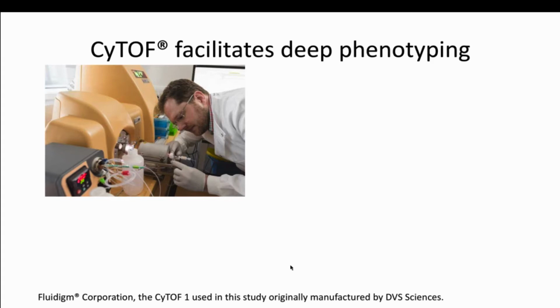Thanks. So it was immediately apparent when you first came to us in the core facility with this project that this was a great fit for CyTOF. This is a project which involves deep phenotyping, so very fine immune phenotyping, and it was working on liquid biopsies. So working with peripheral blood is a great sample tissue, a good fit for doing CyTOF work. It's one of the easiest things that we could work with. And it was an immune-based project, so there were lots of antibodies either available commercially or that we could make ourselves to run in this study.